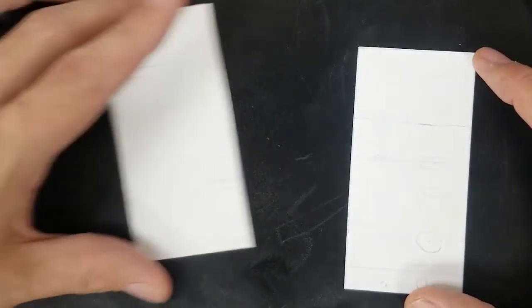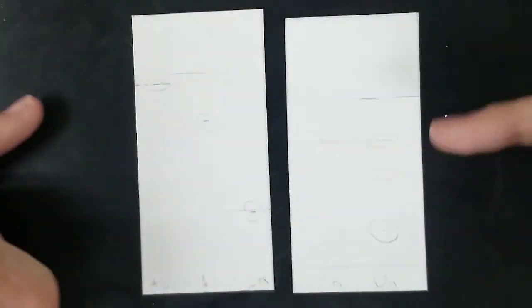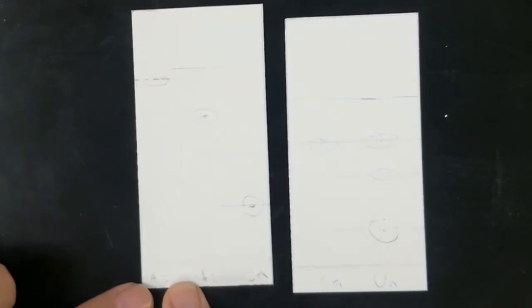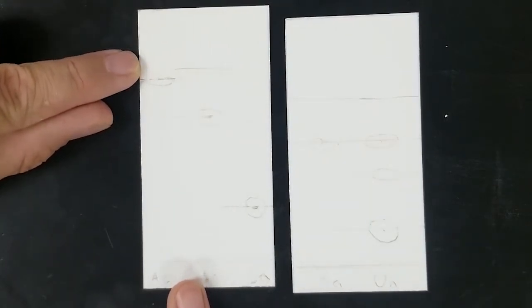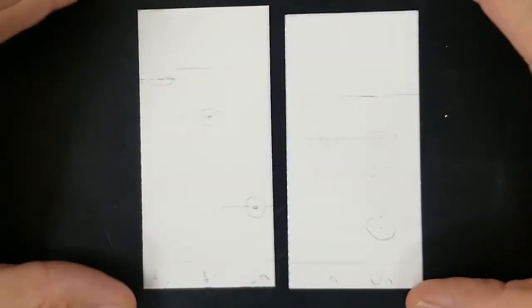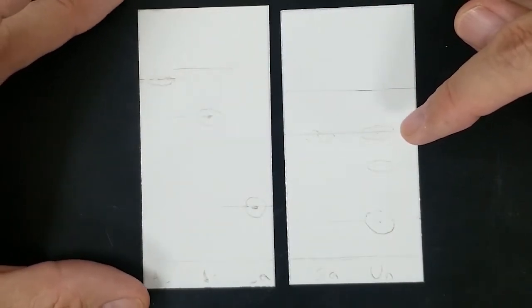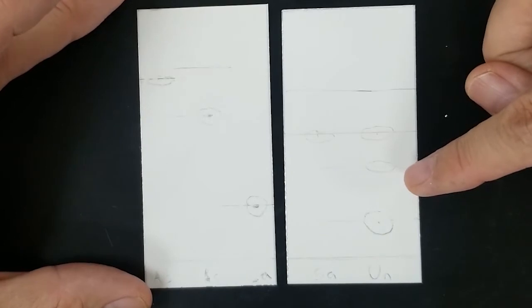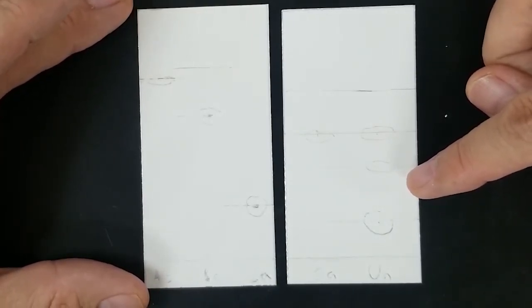Remember, you need to compare them by actually calculating RFs here. But just getting a glance at them, I'm seeing that the acetaminophen kind of climbed the whole plate. It was right behind the solvent front. We did not see one doing that in this one. So I would say that it looks to me like this first spot is very clearly salicylamide. The second spot here is probably caffeine. I don't know.